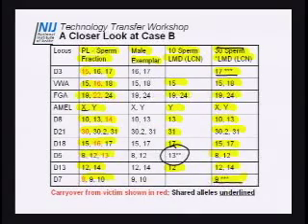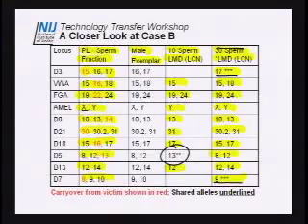So the question is, and something that I'll ask you, what would you rather have? Would you rather have on the left a full mixture like that with all the alleles represented, or far on the right, just the sperm profile, the male profile with maybe just a couple of alleles dropped out? In my mind, I'd rather have a nearly full profile of the male donor without any mixture. So I think these are improved results.